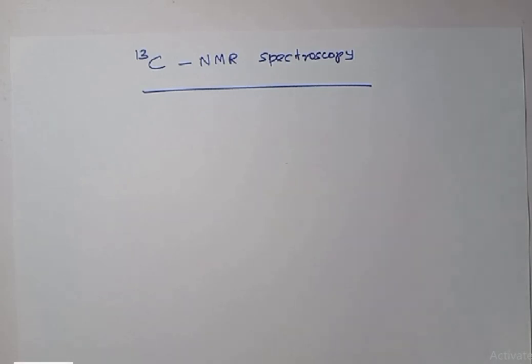Okay, C13 nuclear magnetic resonance spectroscopy. This technique is very useful to distinguish different carbon atoms present in a molecule. C13 NMR, the principles, right? Most of the principles are exactly the same as proton NMR.